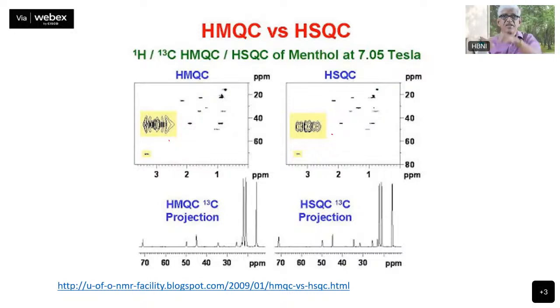So often we record HSQC spectra as a standard, but sometimes you can record HMQC also. If there are mostly no such proton-proton complications, then of course both are the same.